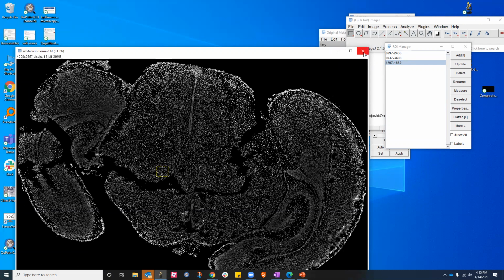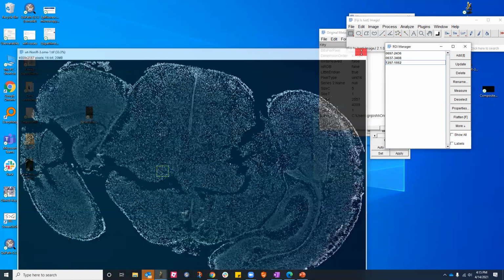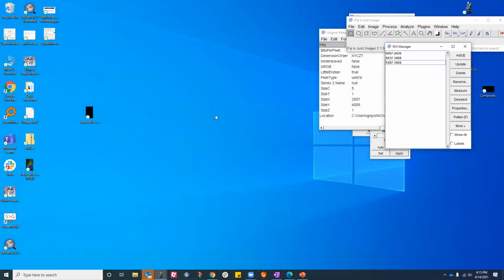Okay. So what I'll do is all the images that I played with, except for this brain image, you have access to it, and you don't need the brain image to do the things the way I was doing. Right. What you can do is you can open some of the images that you have, play with all the options that I talked about. I'll save this video, send it to you. You can go back and forth, look at that, and reach out to me if you have any questions if you cannot perform a certain task. Okay, that would be great.